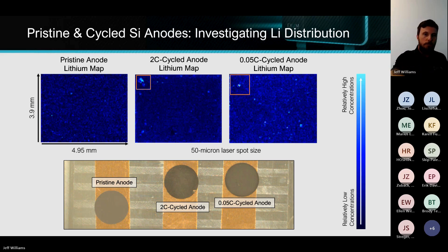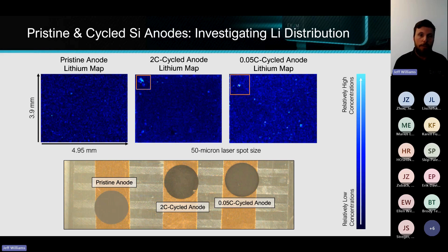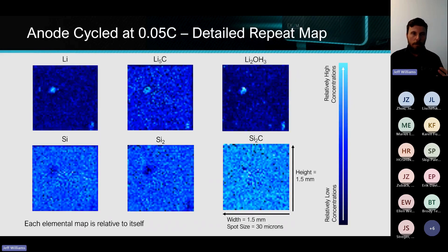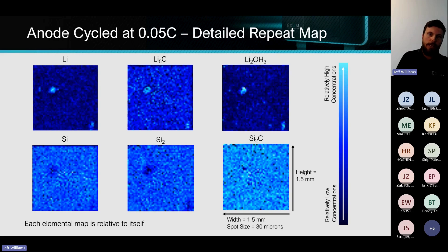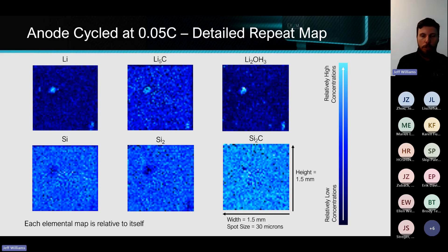For scale, every spot size here is 50 microns. If we zoom in to a 30-micron scale, we can see that the average particle size is maybe 100 microns or so for the very slow 0.05C charge rate anode. And we don't see much of a hole in the silicon — we haven't gotten full removal of silicon or fully plated all the way through to cause a short circuit.